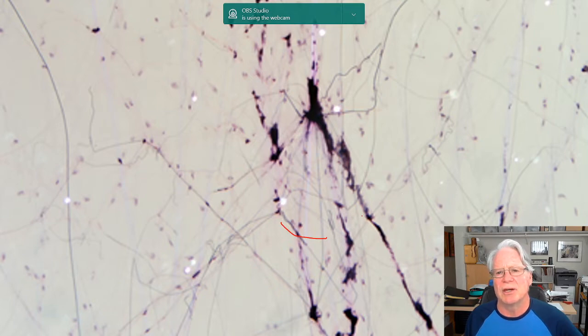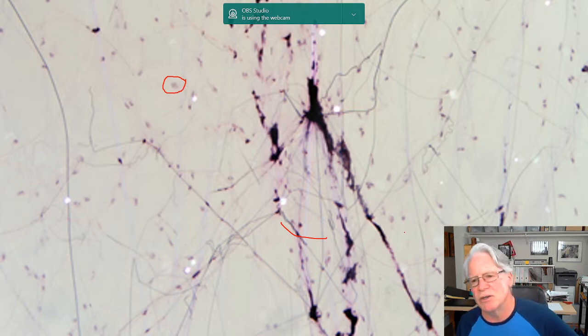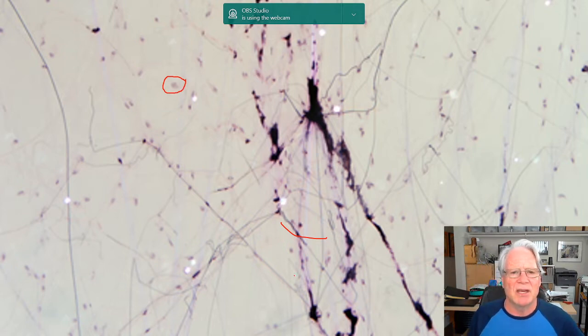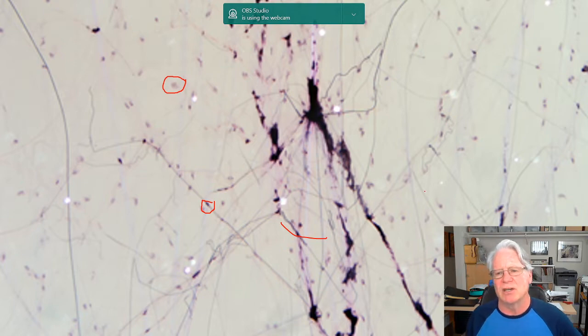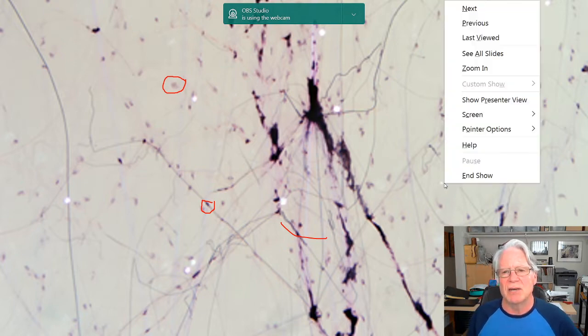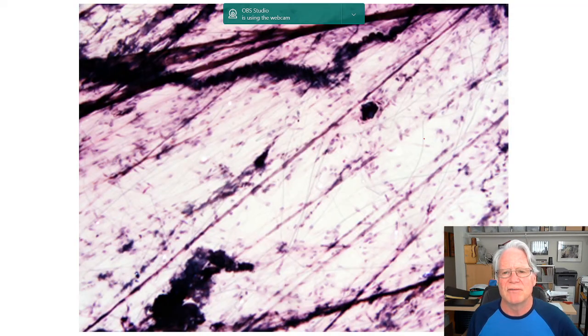The larger fibers are the collagen fibers, and we also see cells. What kind of cells? Can't really tell you. If a cell is connected to a fiber, like this one right here, for example, that's probably a fibroblast. But beyond that, I couldn't tell you what kind of cells these are, and I wouldn't ask you to identify that.